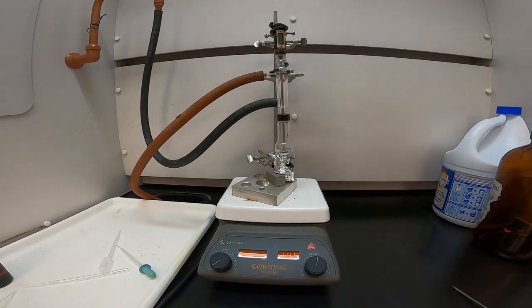Alright, so the distillation process has proceeded probably another 20 minutes. It probably takes about an hour total to do the distillation. Some things I've added here, I wrapped the bottom of the setup with aluminum foil. It just helps keep the glassware in the lower part warm enough so the vapors can rise up into the condensation area where we want them to condense.